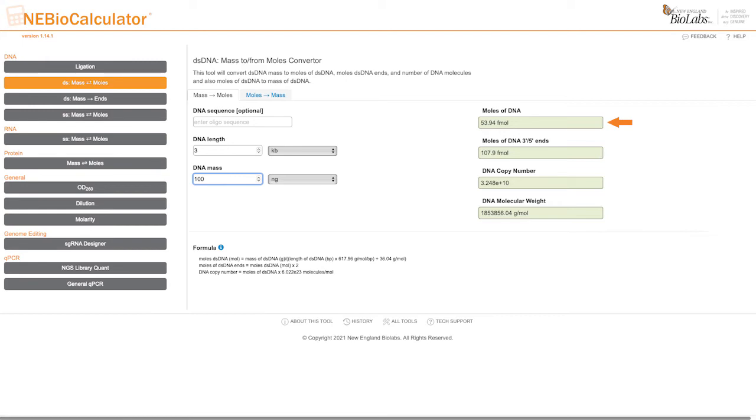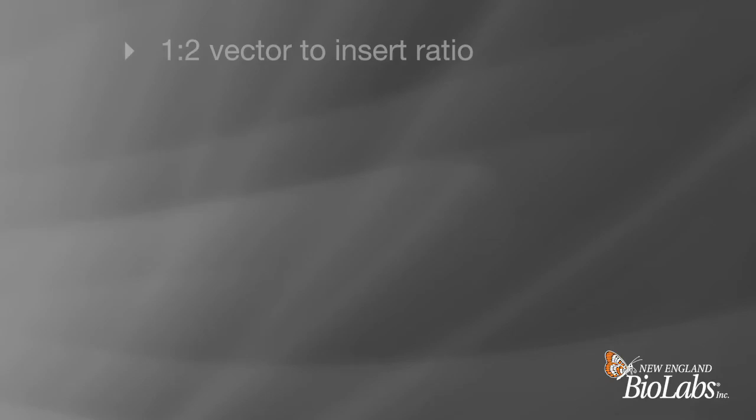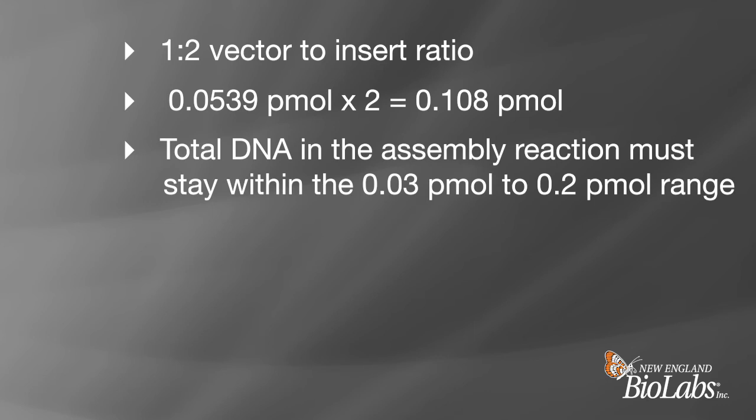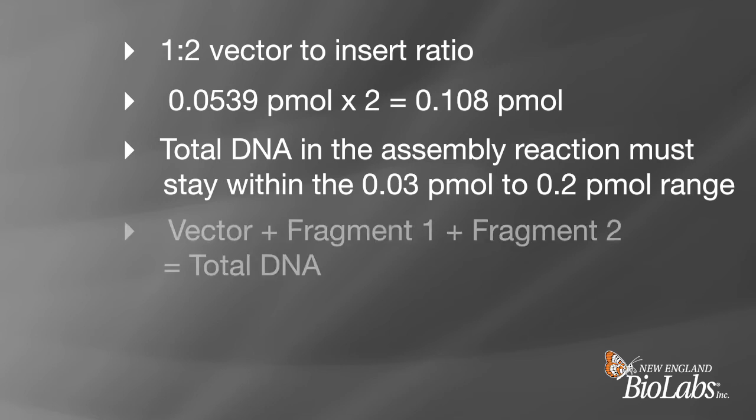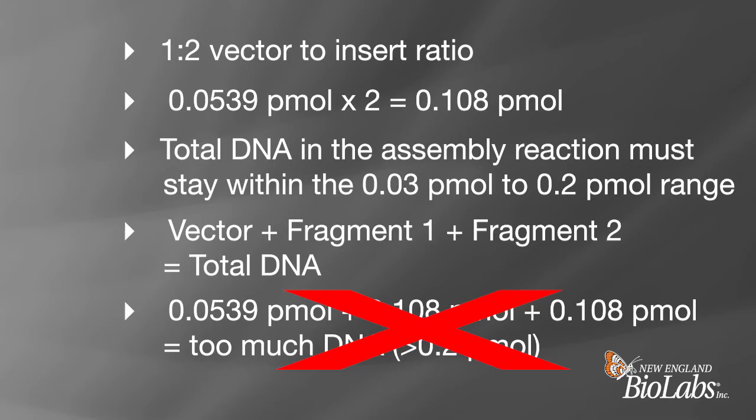We can then use this to determine how much insert DNA to use. For the inserts, we need a one to two vector to insert ratio. Multiply 0.0539 picomoles of the vector by 2 to get 0.108 picomoles of each insert fragment. It is important to stay within the total DNA recommendation for the assembly reaction, or 0.03 to 0.2 picomoles total. If we sum the total DNA for our fragments, you can see that we have greater than 0.25 picomoles of DNA, which is too much.